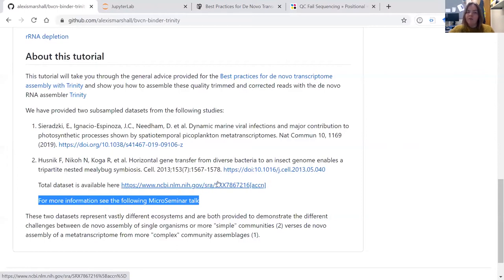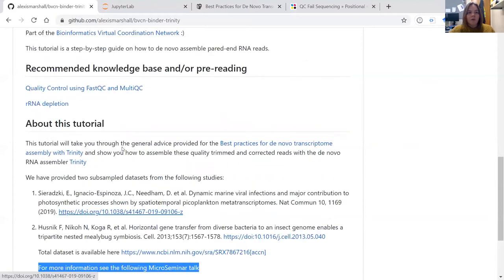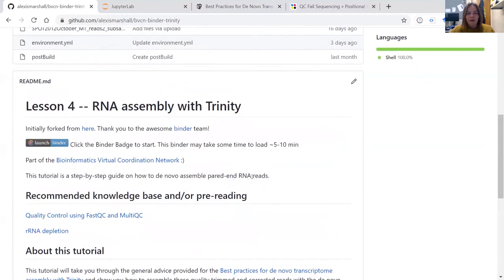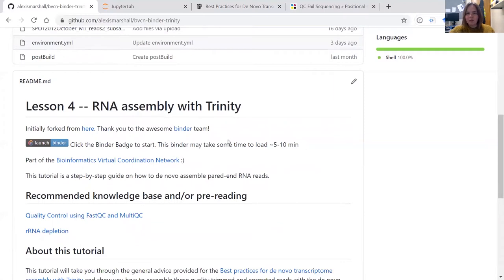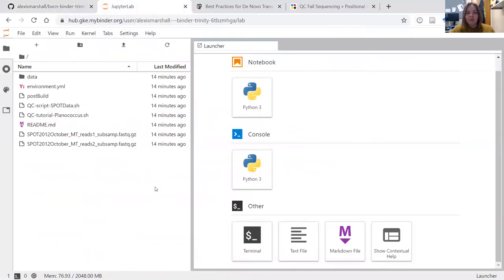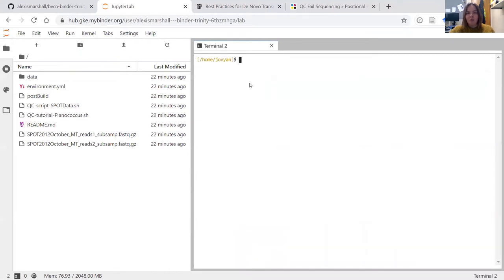Today's tutorial is based on a very small subset of this data. Once you're ready to run the tutorial, just double click on the Binder link. The Binder will take some time to load - between five and ten minutes - because there's so much software and data associated with this tutorial. Once it loads, you'll see an interface like this. The terminal we're going to be using today is located in the bottom left; just double click on that and it will open up the terminal environment.